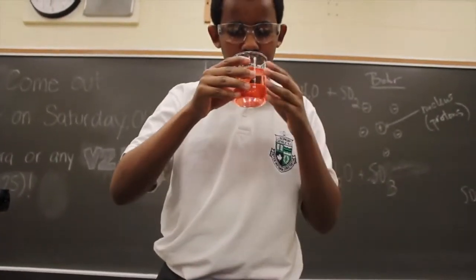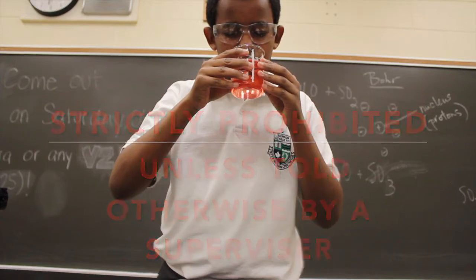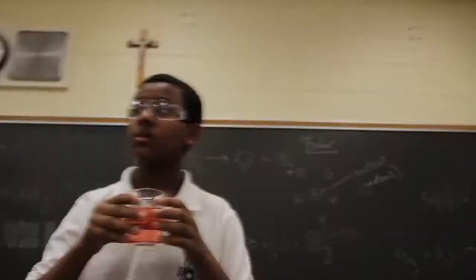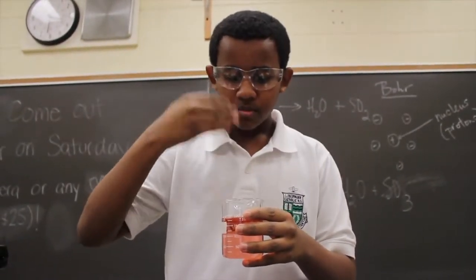Smelling chemicals is strictly prohibited unless given permission from the adult or teacher in charge. When given permission, refrain from smelling directly over the beaker. Instead, wave your hand over the chemical towards your nose.